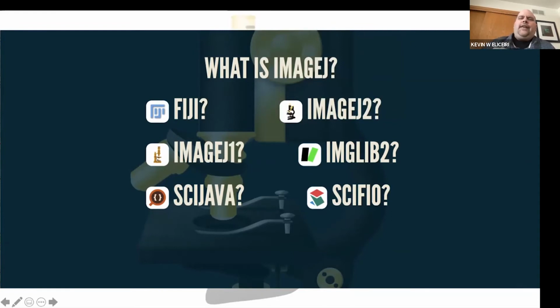So we have, of course, added to the full suite of what ImageJ can do, but perhaps the complexity. And so one thing I do want to explain as we go through it, that this ImageJ ecosystem contains a lot of elements now. There's Fiji, which is the preferred way, kind of the batteries included way of using ImageJ. There's the original ImageJ 1, which we rarely talk about because we also have ImageJ 2, and these days, it's been so long since we developed ImageJ 2, and so much is integrated into the new Fiji that when we say ImageJ, we usually refer to all this.